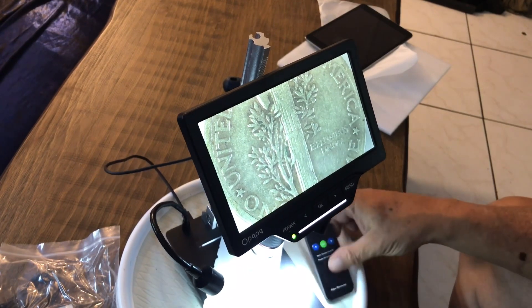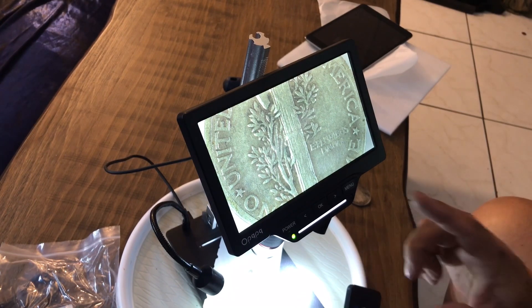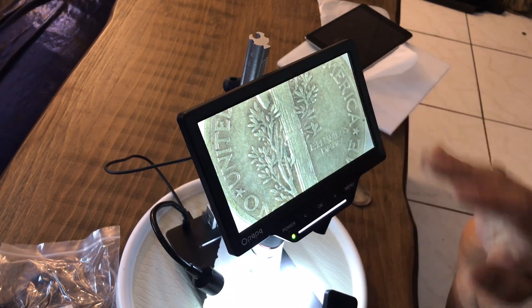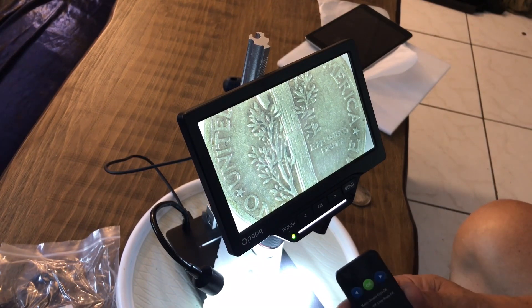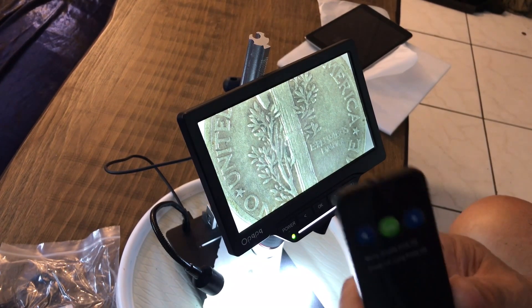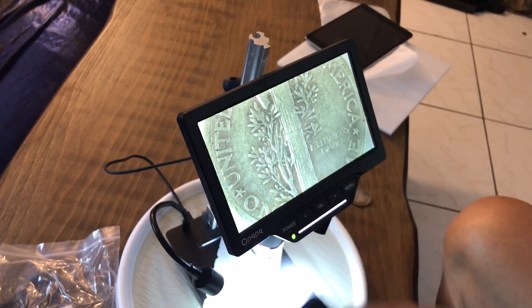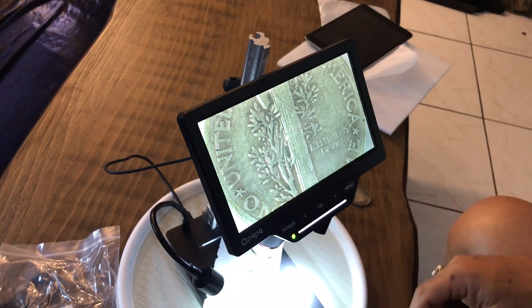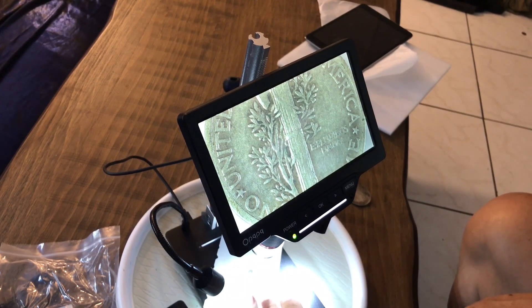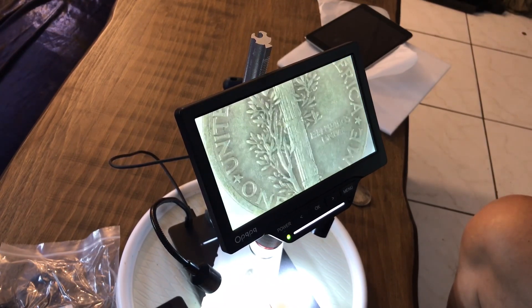And then the remote control — this really seems to me like it was designed by people who actually use microscopes. One of the problems I had with the last one is whenever you touch the buttons, everything wiggles and jiggles. The remote control alleviates that. You work through the menu system with a very simple remote — zip zap and does its thing. Very easy, simple menu system. It's basically a reproduction of what you've got right here, except when you click it, it brings up the menu. It makes it really easy to do your recordings and snapshots. It's got built-in recording, output to TV, and output to your computer. I'm just really impressed with how well this thing works.